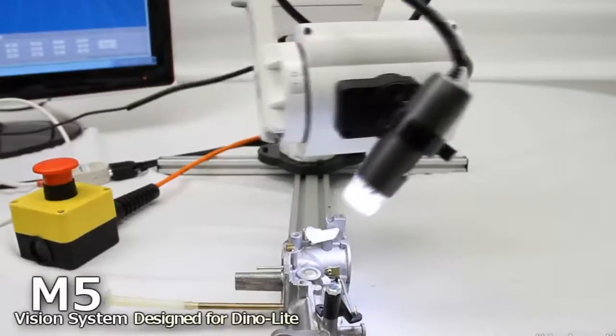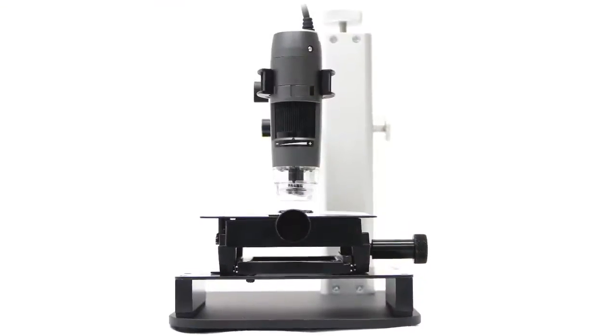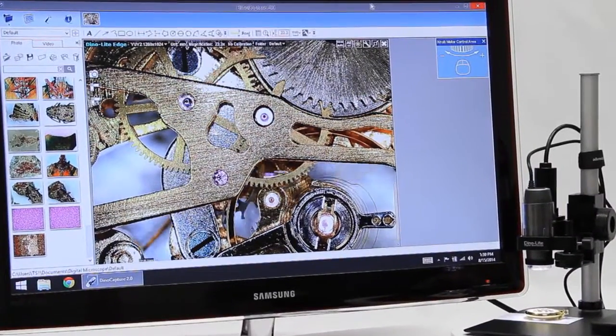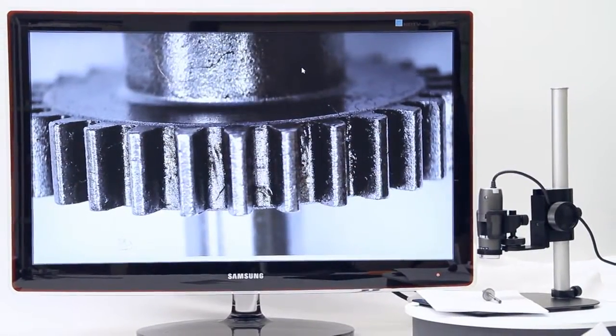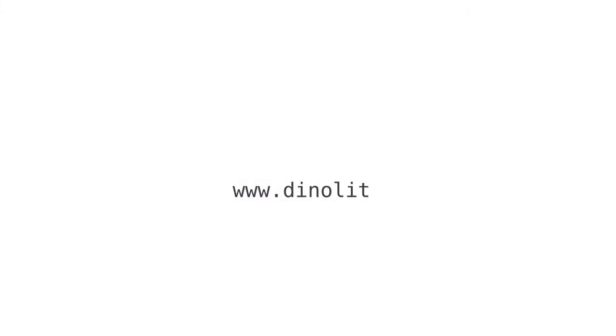Each DinoLite microscope features the highest quality components, powerful and easy-to-use software, comprehensive support and updates, portability and convenience, all in a single cost-effective device. For more information, visit www.dinoLite.us.